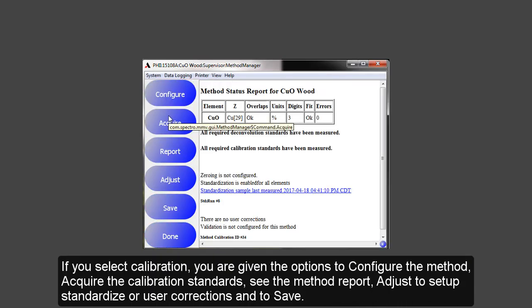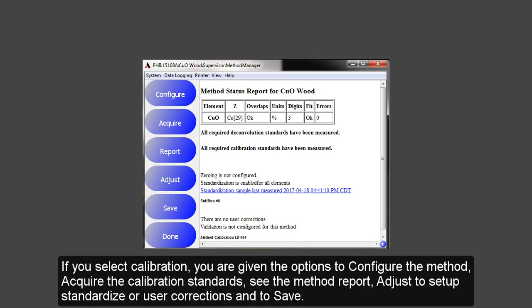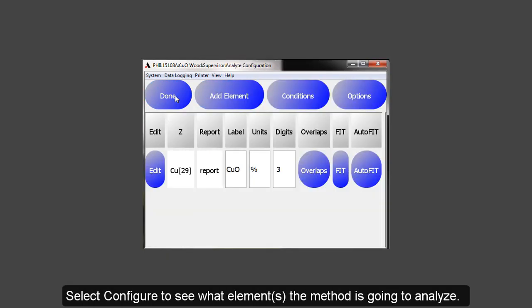If you select Calibration, you are given the options to configure the method, to acquire the calibration samples, the method report, adjust to set up standardized or user corrections, and to save. Select Configure to see what elements the method is going to analyze.